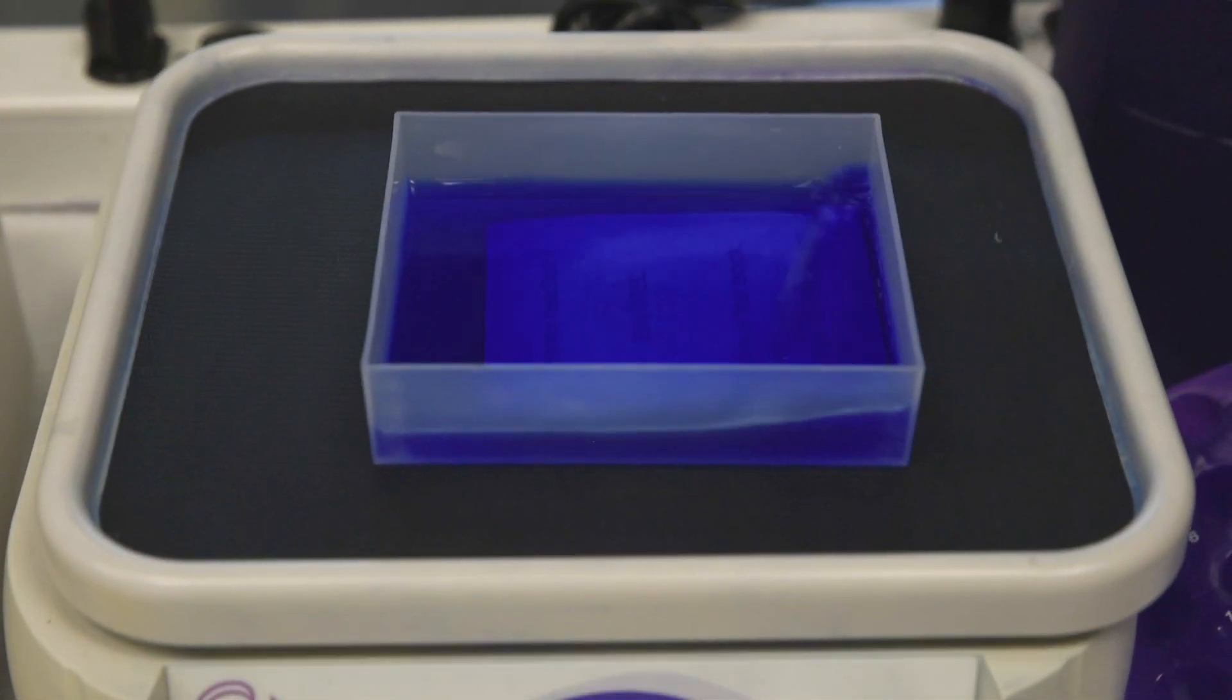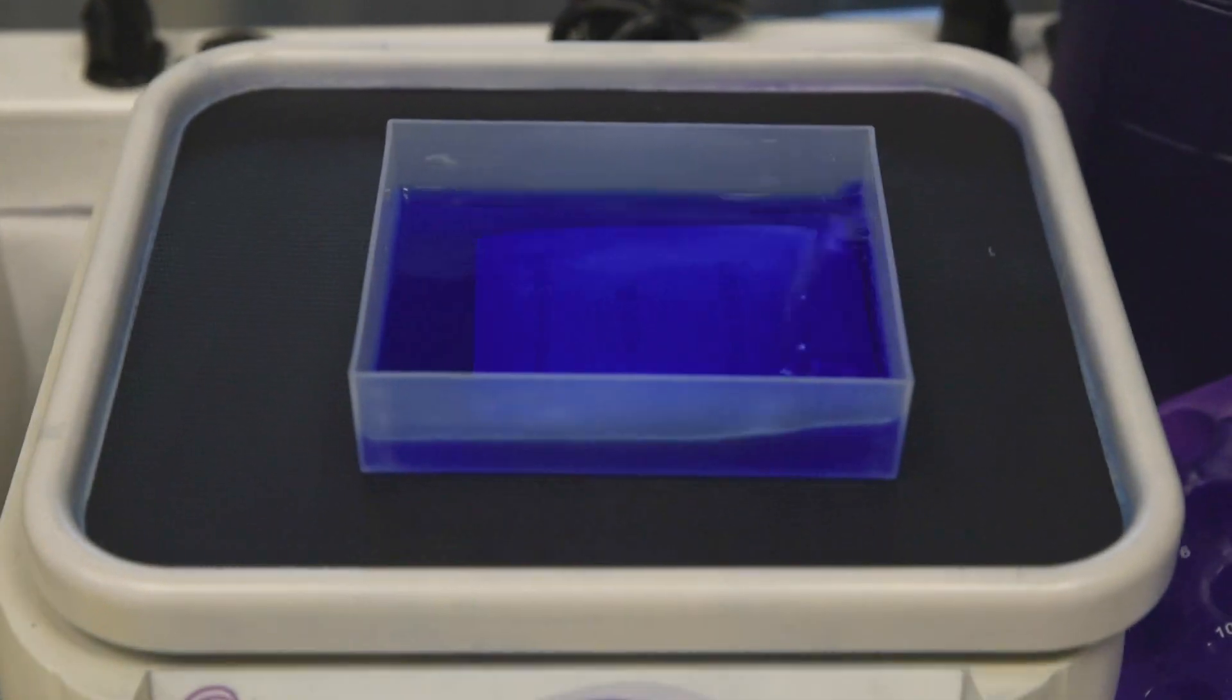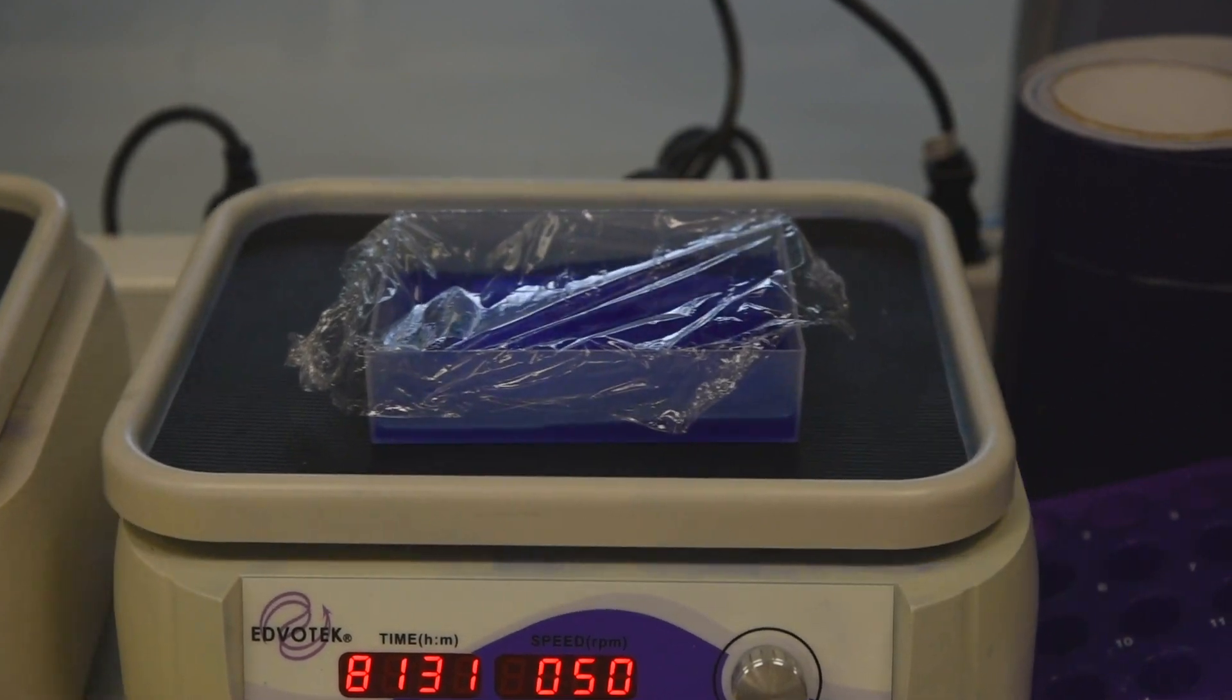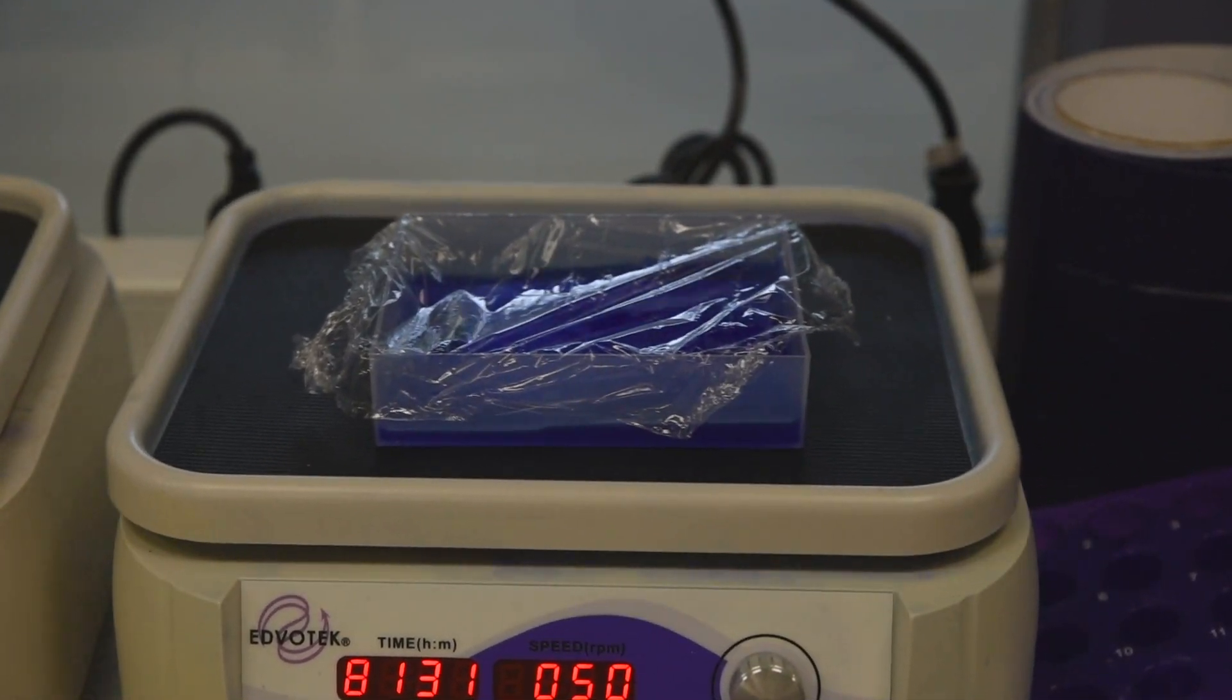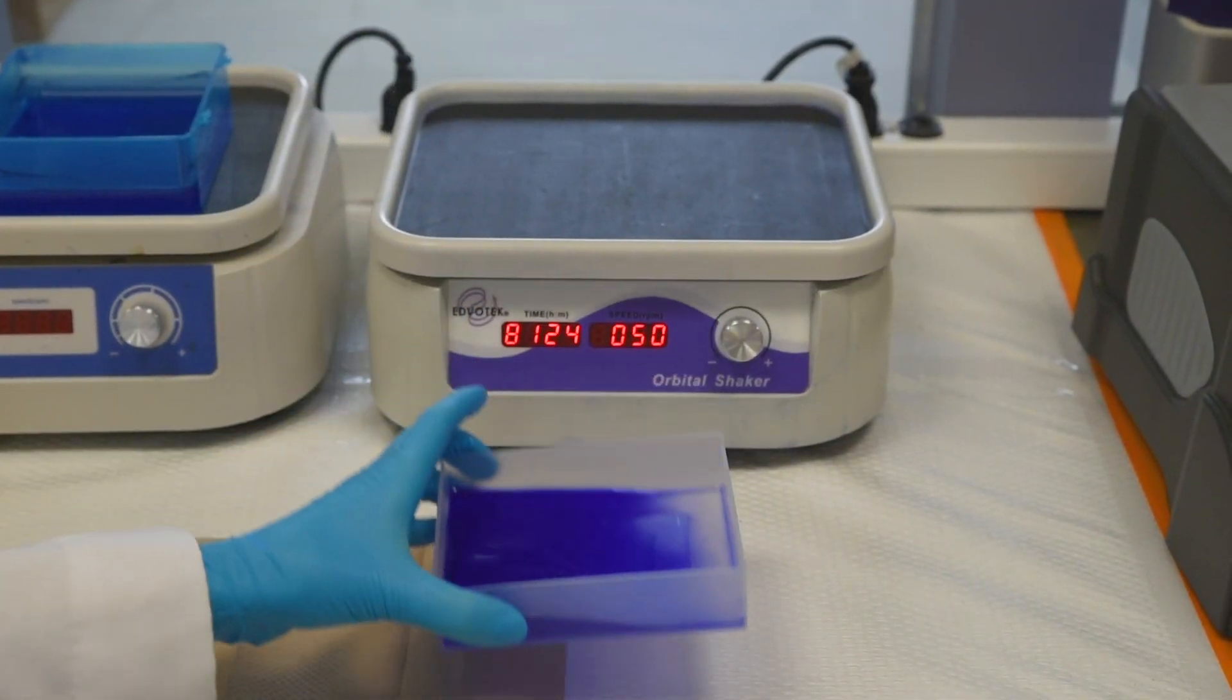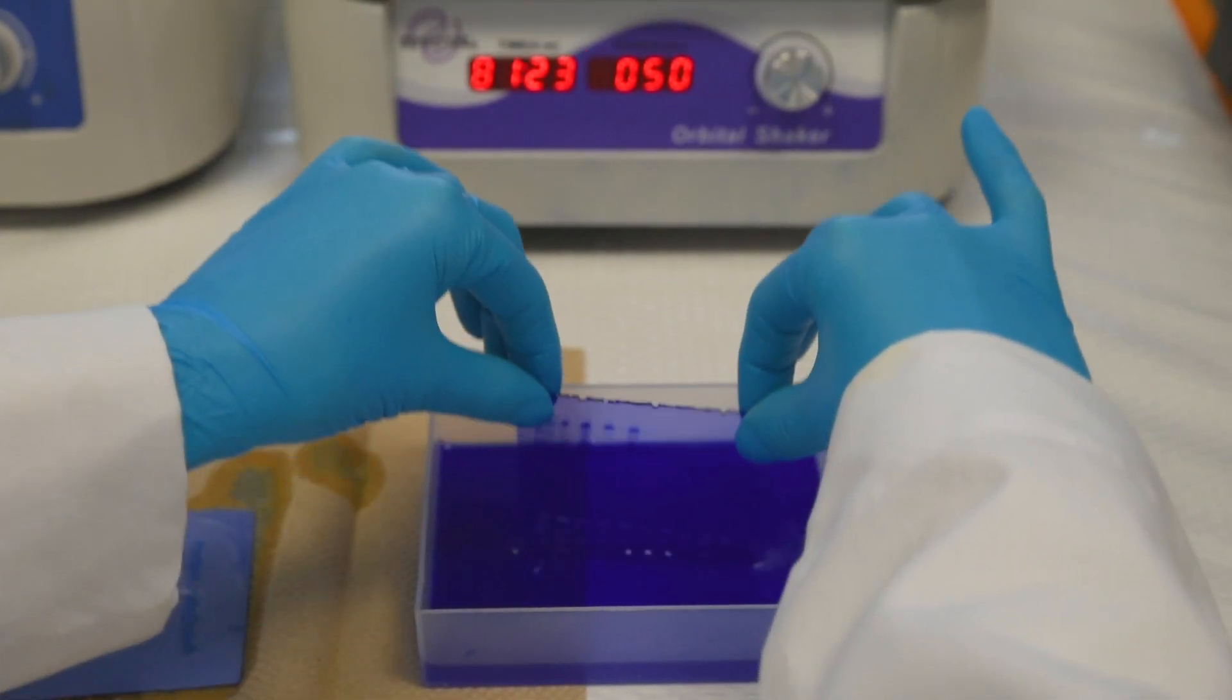Step 7: Remove the paper after an hour and allow the gel to gently agitate on a rocking platform or just on the lab bench for 1-3 hours or overnight. Cover if incubating overnight. Step 8: After staining, protein bands will appear medium to dark blue against a light background.